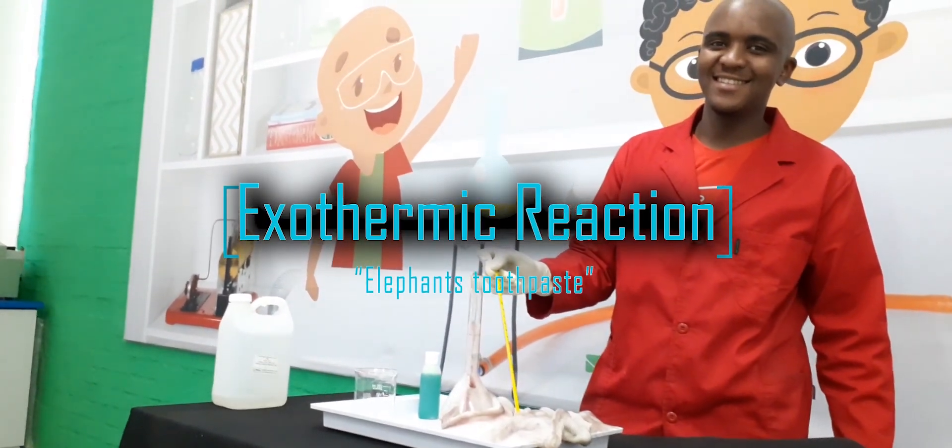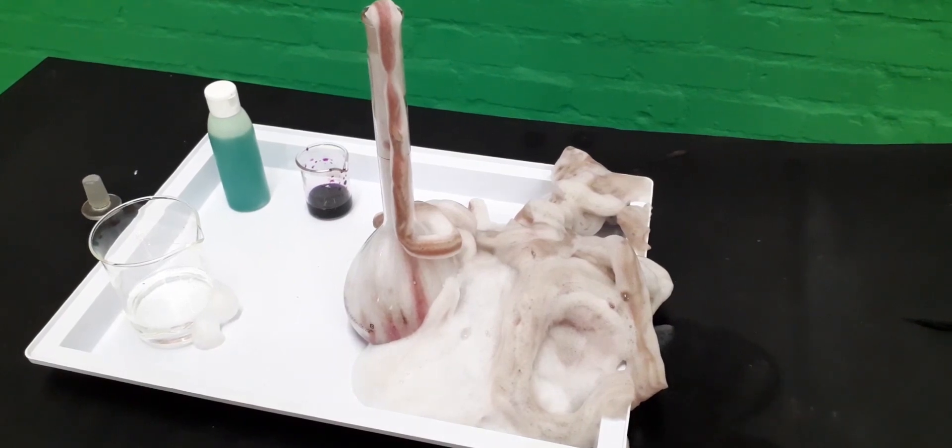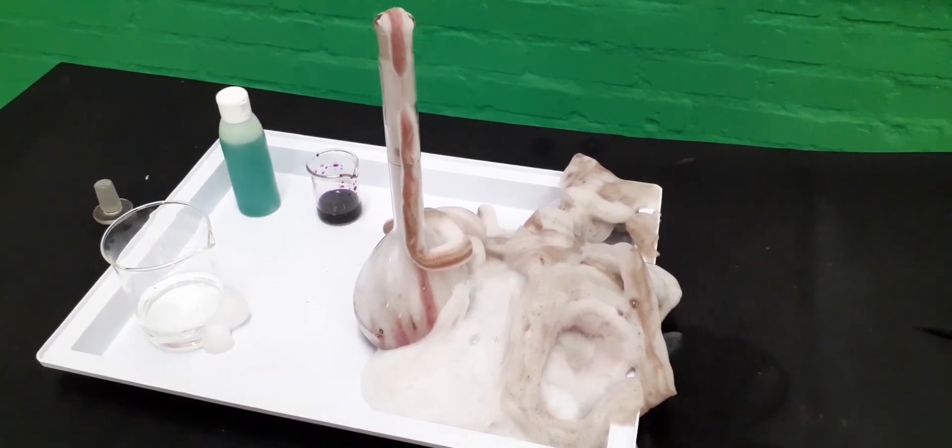An exothermic reaction, a reaction that gives off heat to the environment. Want to find out what experiment caused this fascinating mess? Stay tuned.